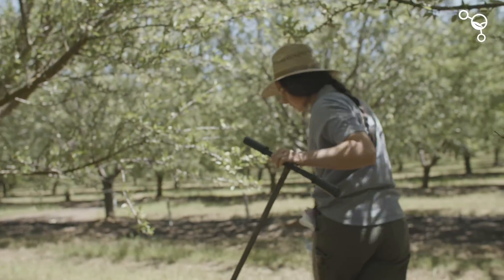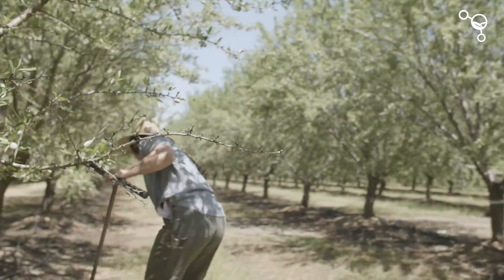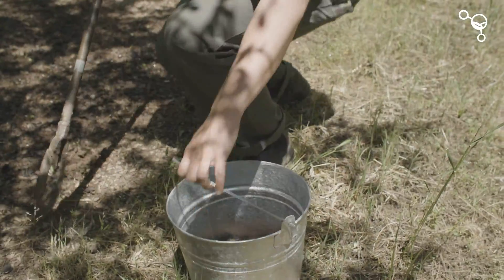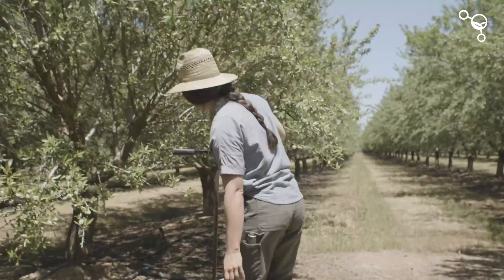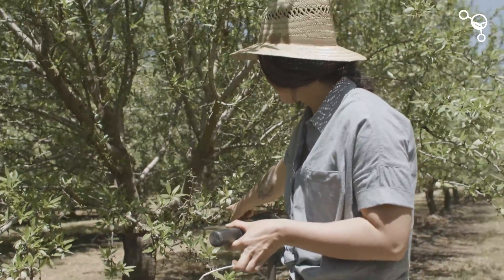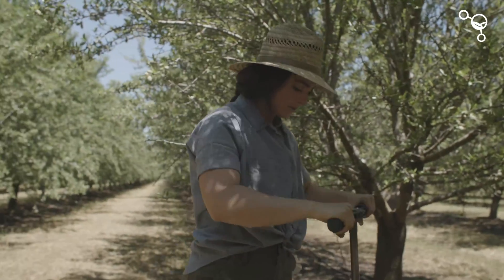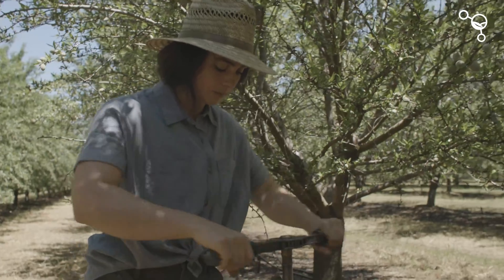In the same management zone we're just going to collect two more samples. We're trying to stay within the irrigation area within the tree root zone. This will be the third core that we'll collect. Again, you can have up to 12 cores.